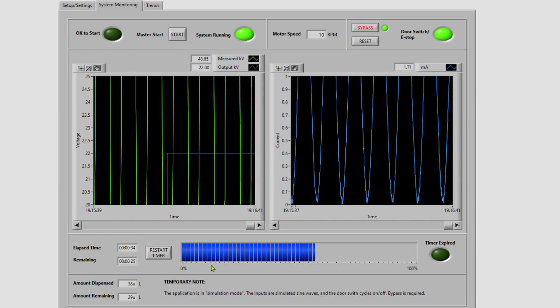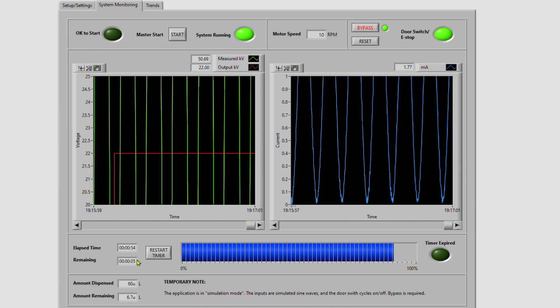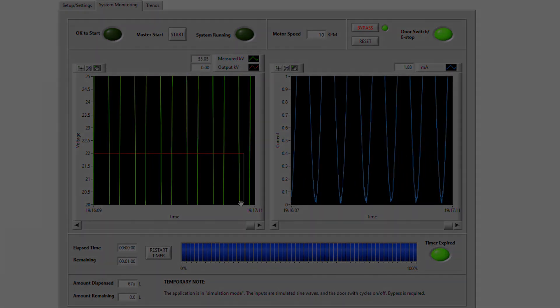We can monitor the progress of the timer. When the timer expires, the system turns off.